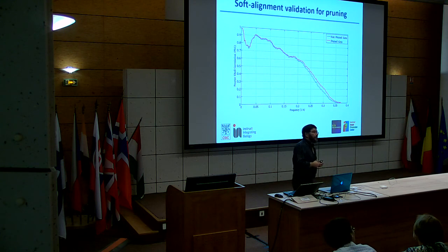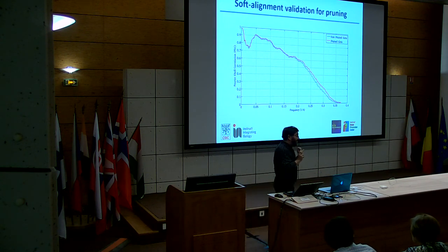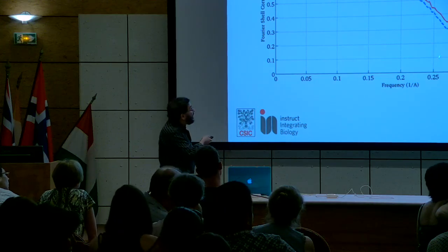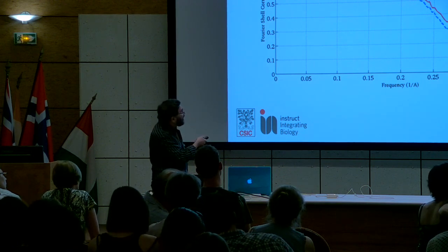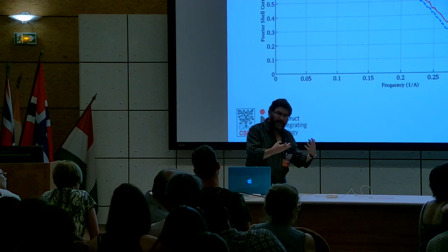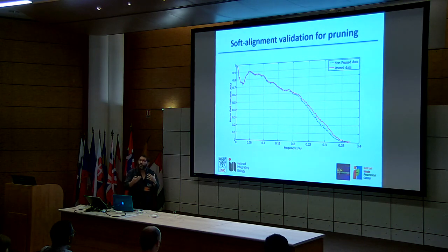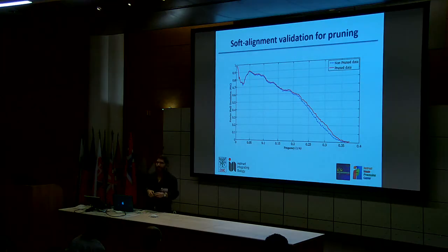But at the end, do you think that you end up with a number which is comparable? Yes, I mean, we use it in the same manner, although the meaning is really different. But at the end of the day, we are saying, listen, we are able to reproduce, we have to put a threshold here, I'm not getting into that, but we are able to reproduce the structural information up to a certain frequency. So you give me a different data set, I produce the same map up to that resolution. This is what we mostly mean in the field when we talk about resolution.